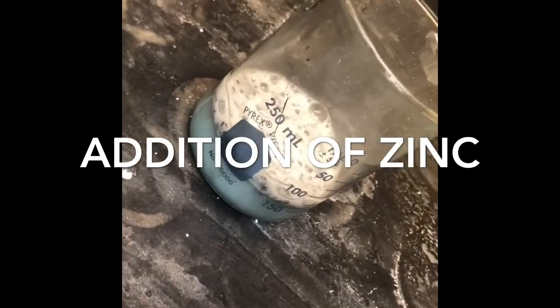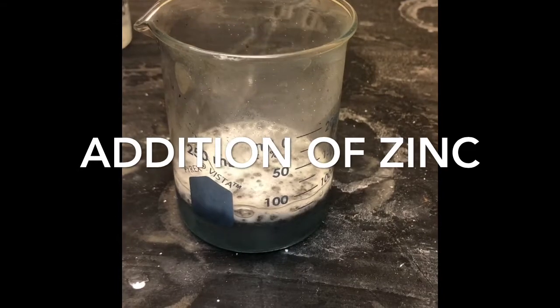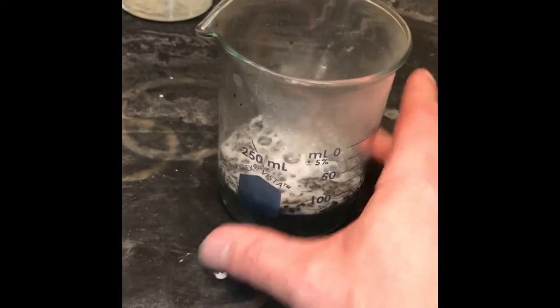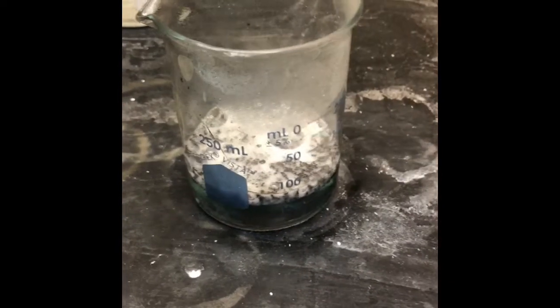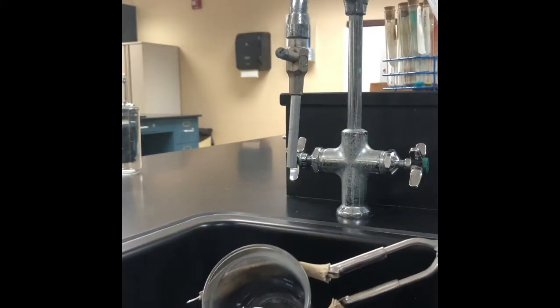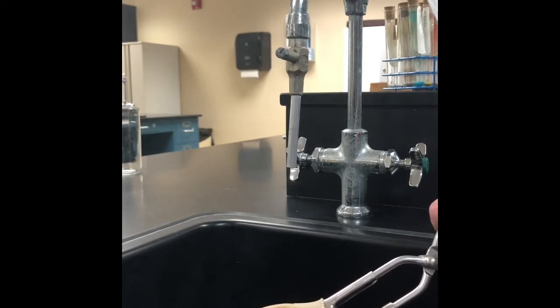And so, bubbling quite a bit, and we're going to let it stay under the fume hood until the reaction finishes up. So going on, if you actually touch the beaker like I am, it's very warm. Okay, so it's probably going to be an exothermic reaction. Okay, so the next portion of the lab says that we're going to pour off the liquid. And we're going to try and keep all that solid.